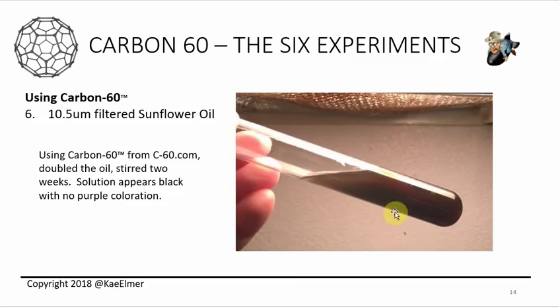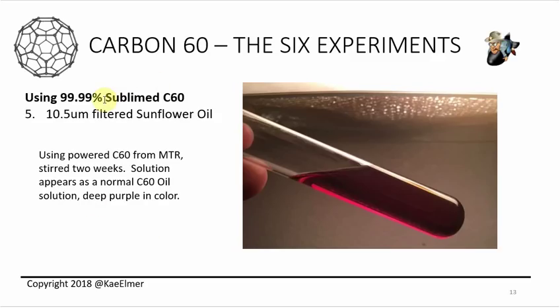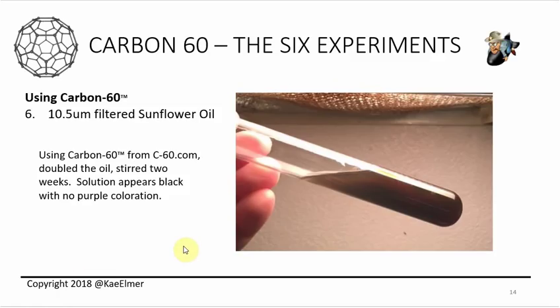It came out black, and there's no purple coloration. So what's really interesting, and I just want to point this out, is that the Sublime C60 is pure C60, never touched a solvent, and it's purple. So there's nothing in it other than C60. That means the true color of C60 is purple. And so now the Carbon-60 product is claiming to be C60, and it comes out black. Of course it's proprietary, and I don't blame him. He doesn't want to share how he makes it, and he doesn't want to sell the powder. So the only way you can do this is to buy the product and then do what I did.